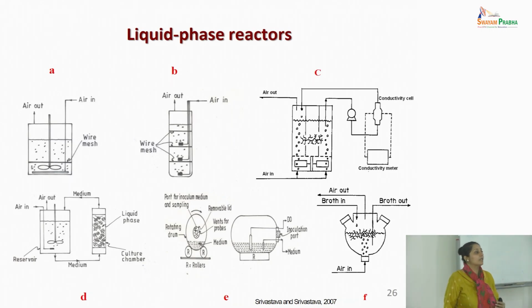Then people have also planned to divide differently. I was talking about the hyperhydricity problem with organ cultures or root cultures, which means a lot of water retention can lead to thicker boundary layers and therefore nutrient and mass transfer limitations. So how can you avoid that problem? You have to reduce the boundary layer phenomena, which means you do not allow water retention to happen on the roots. So what can you do?